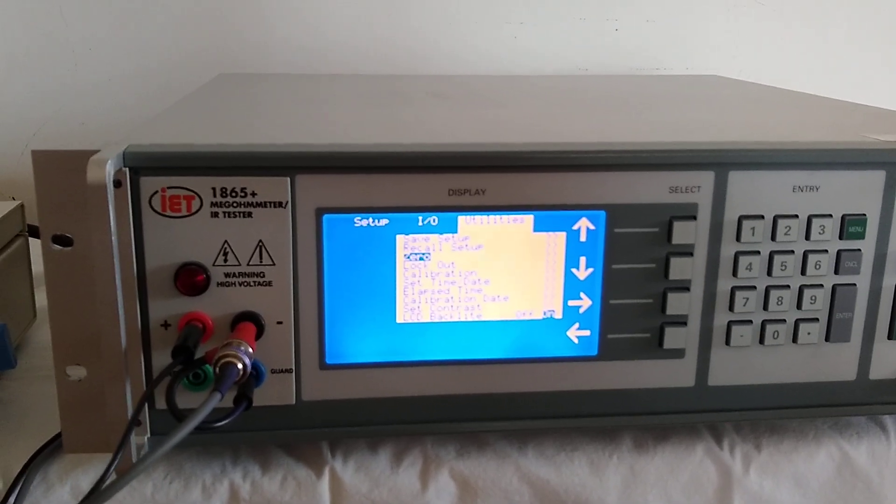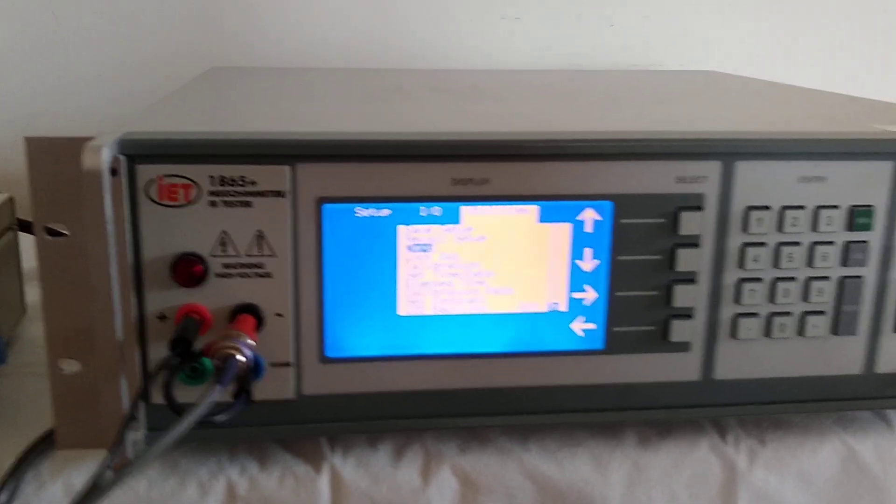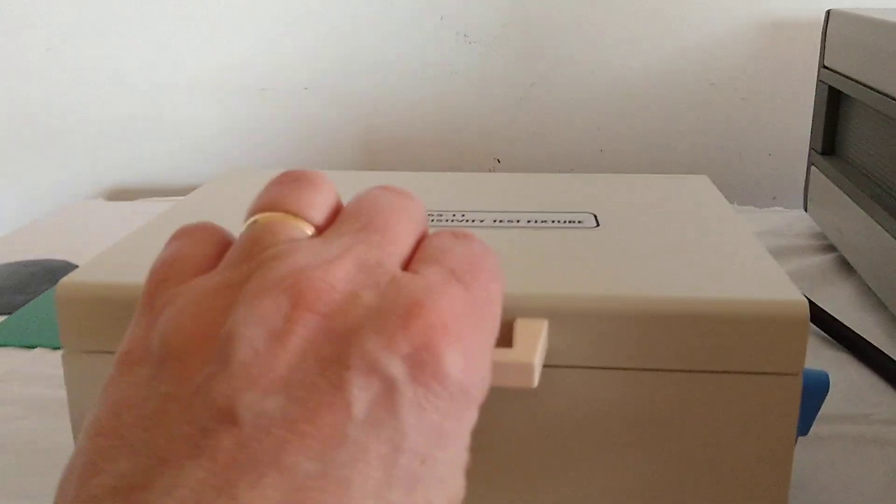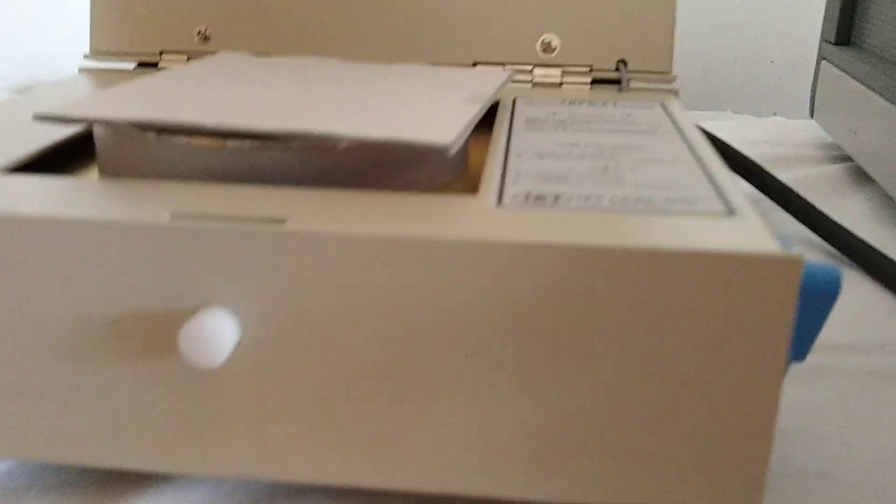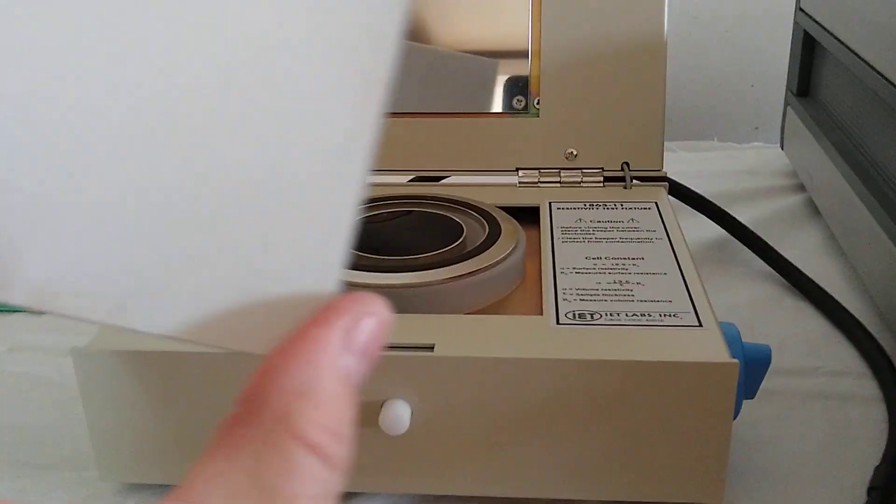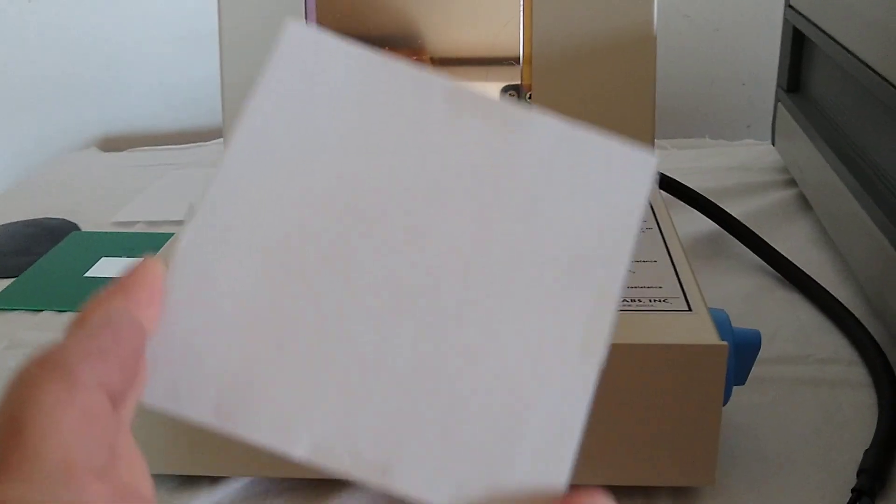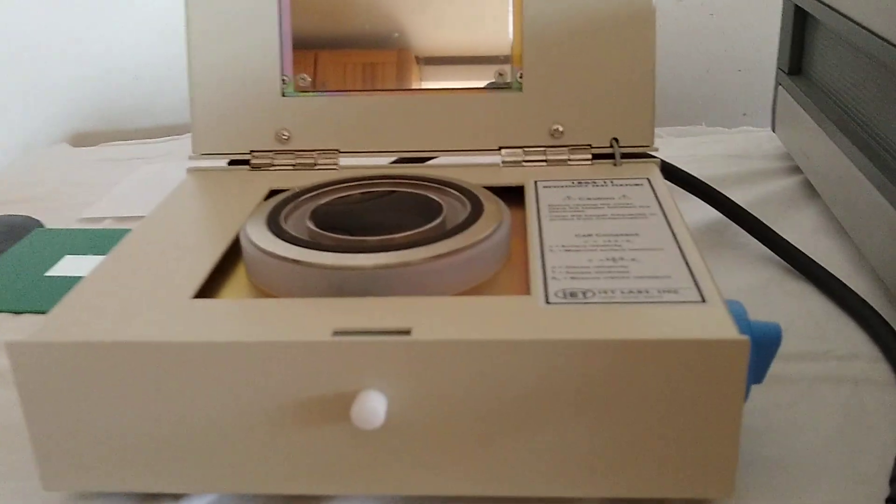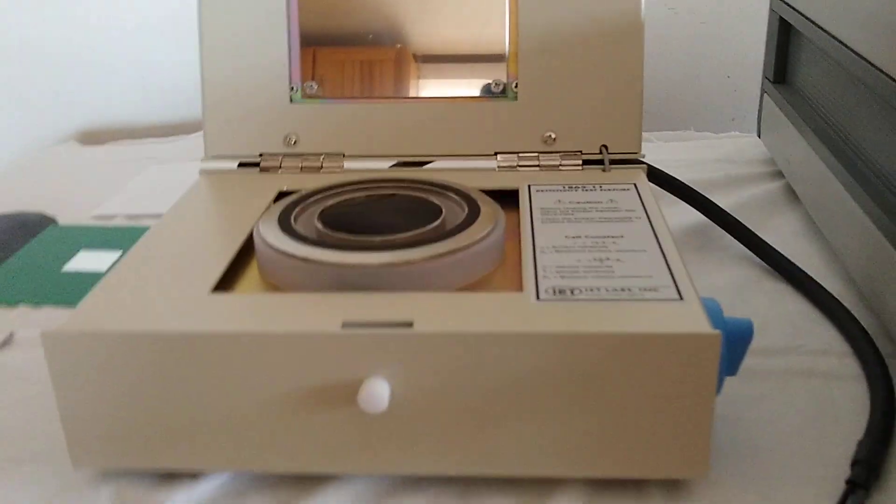To prepare for the zero, what we want to do is open the 1865-11 up. Once you open it up, you'll notice that it's shipped with a piece of cardboard. This is just to protect the electrode. We set that aside.